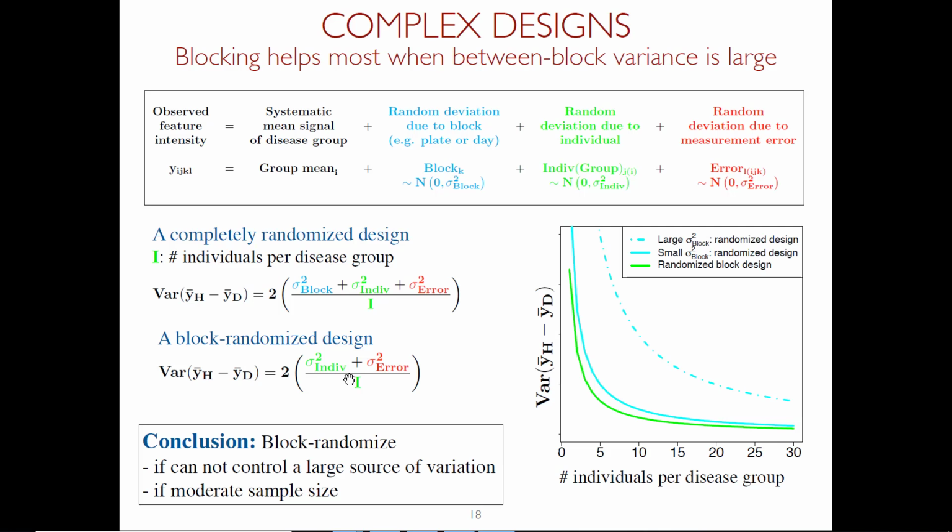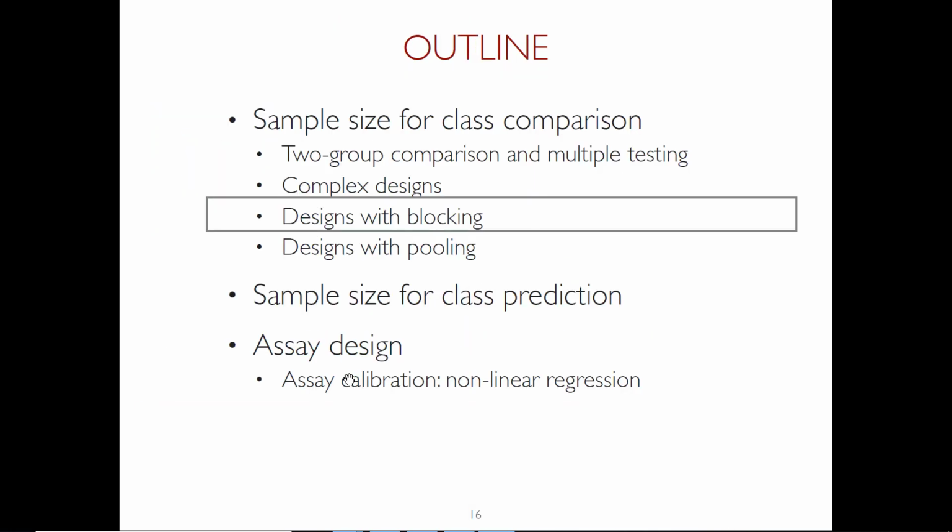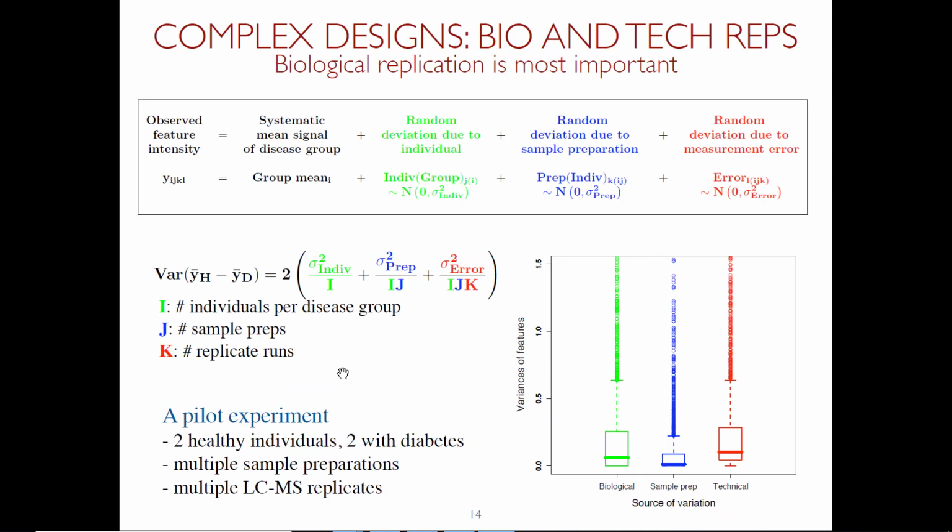Right, actually really good question. So here, what I did was I took box plots, right? So they're summarized. So essentially I fit this model for each protein, right? So you do the same thing because of course different proteins have different biological variations, and so on, right? So you literally write a loop. You have 1,000 proteins, you'll fit this model 1,000 times. So it means that you have 1,000 of those variance components. So here, I just drew a box plot of them, right? So I have 1,000 values here, 1,000 values here, and so on.